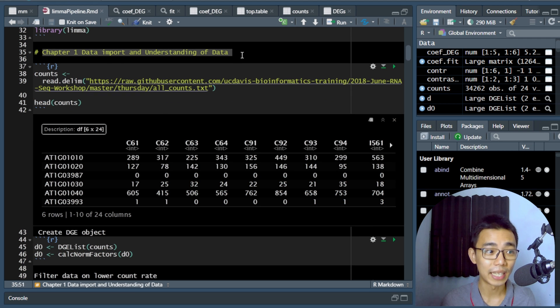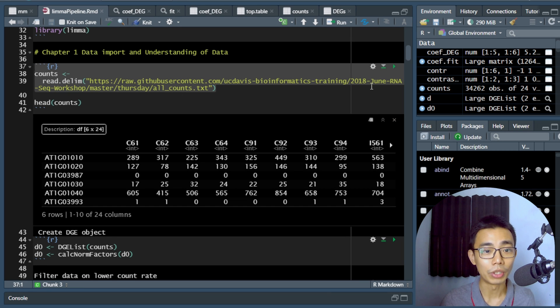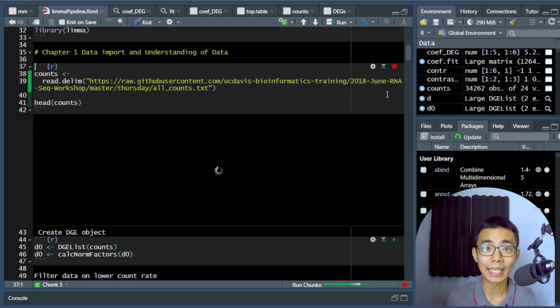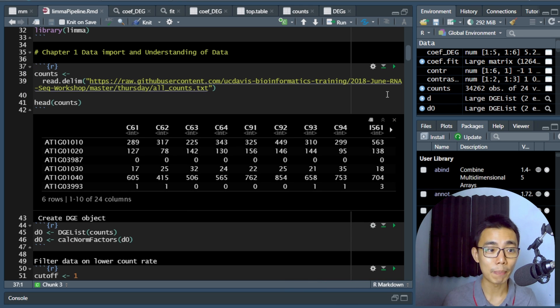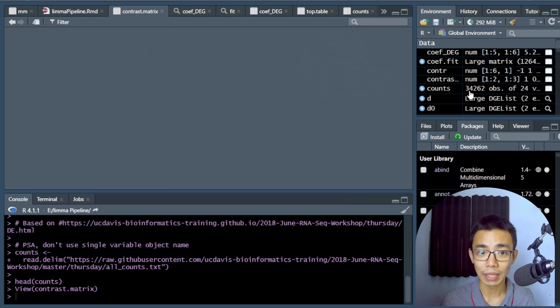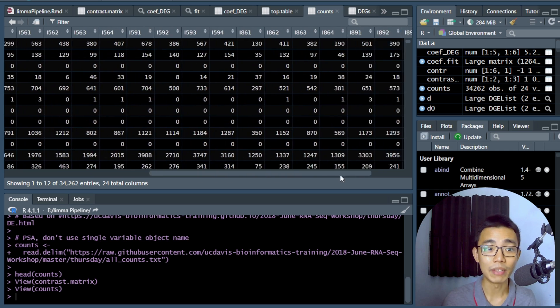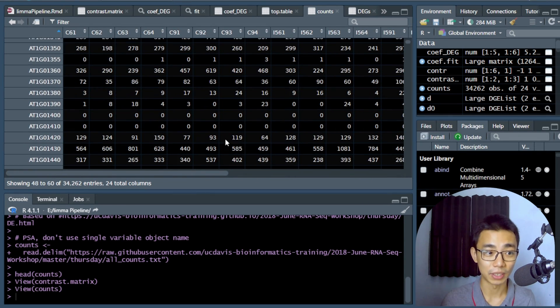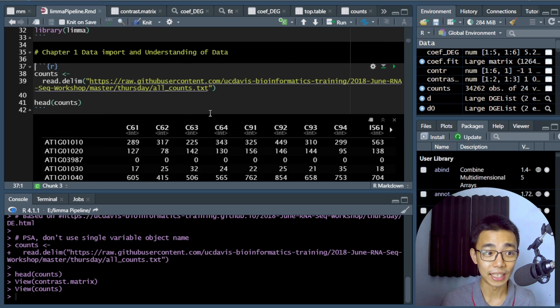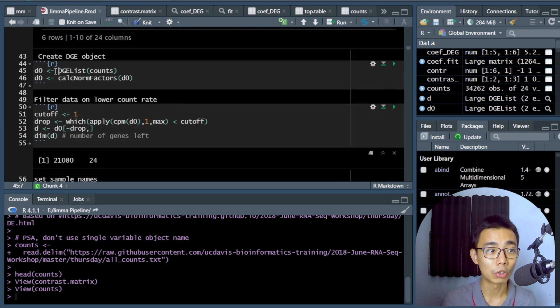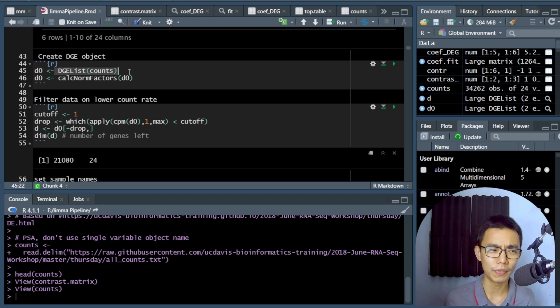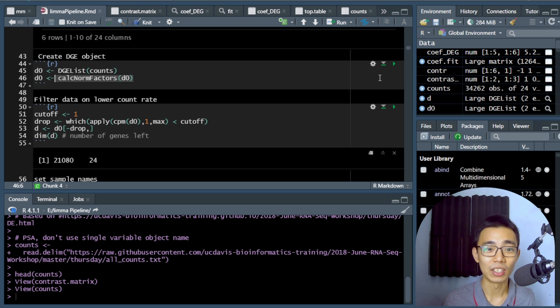Let's move into chapter one: data import and understanding of the data. The first step is to read in the original count table. We're loading 24 individual samples with around 34,000 genes. The count table contains integers as expected for RNA sequencing data. We then construct a DGE object using the DGEList command and calculate normalization factors to correct for different library sizes.